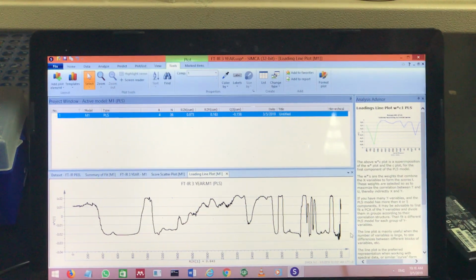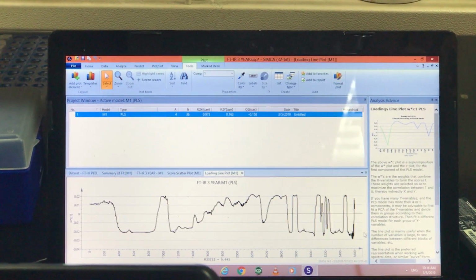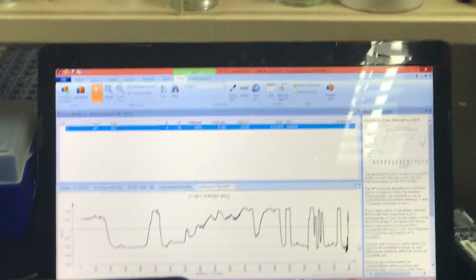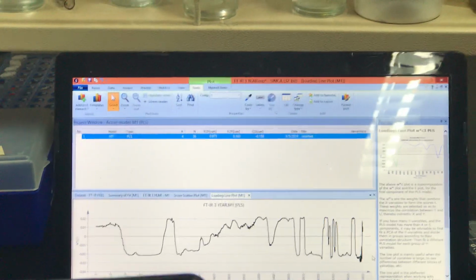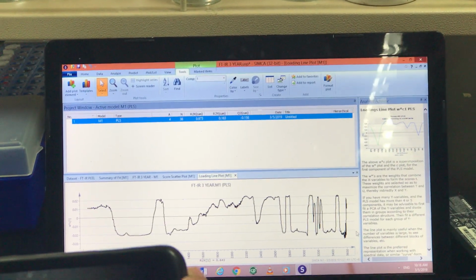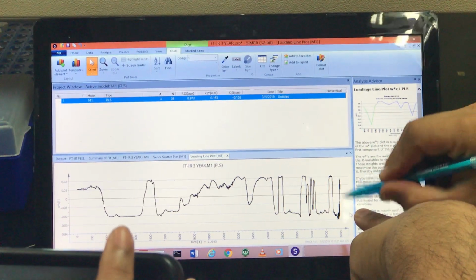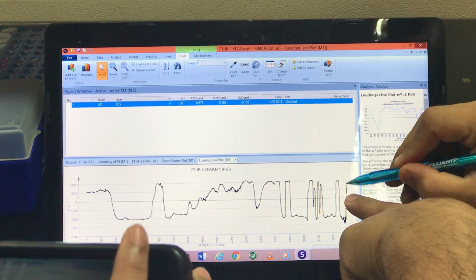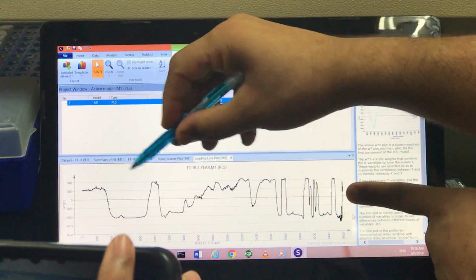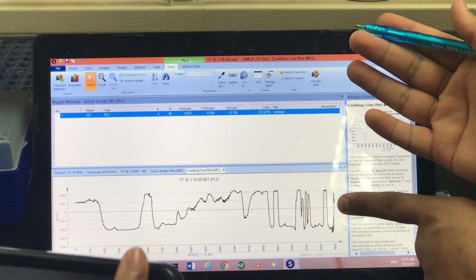Yeah, the IC50. But in our case, we use the inhibition. That means the highest inhibition, the highest activity. High inhibition, high activity. In IC50, no. Less IC50, high activity. In this case, the last line usually is the IC50, the inhibition, the activity. In our case, if it is up, that means the activity is up, and the non-active fraction group is down.